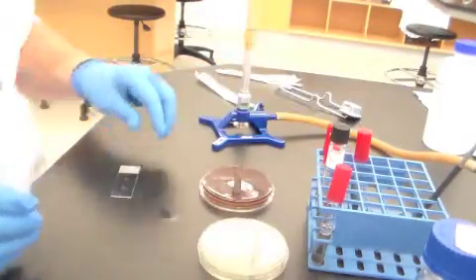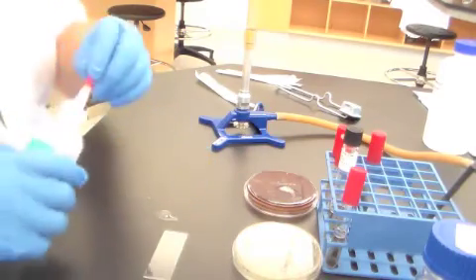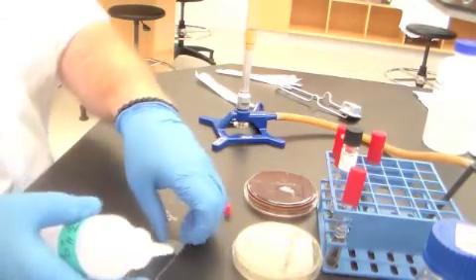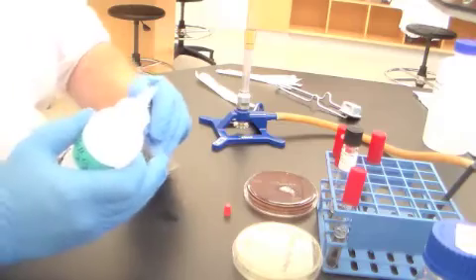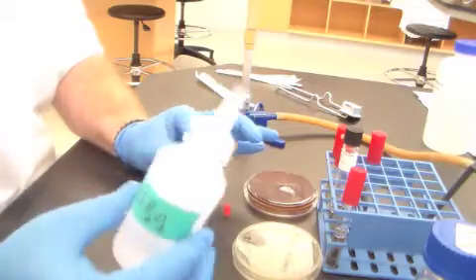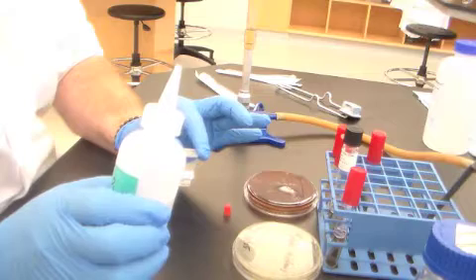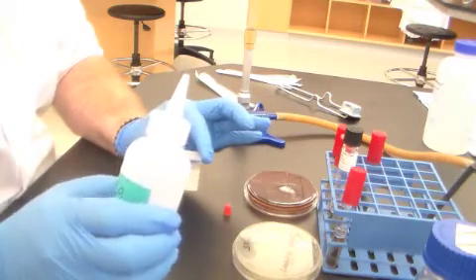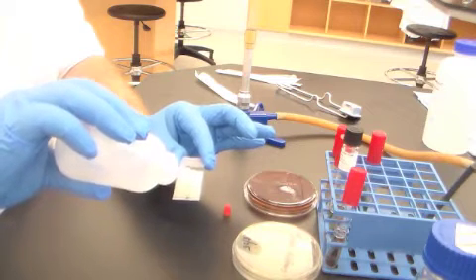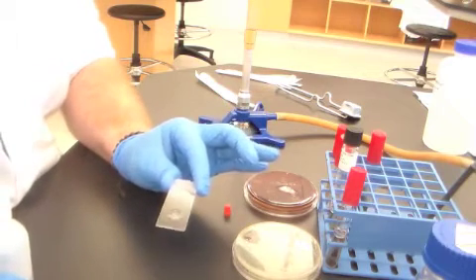Now, here's where the fun part comes in. Remember that Streptococcus is on my right, and Staphylococcus is on the top. And I'm going to take, this is 3% hydrogen peroxide. This is hydrogen peroxide just like you would buy at the grocery store or the drugstore to disinfect wounds. I'm going to put a drop on top of the Streptococcus, just 1 or 2 drops. And I'm going to look.